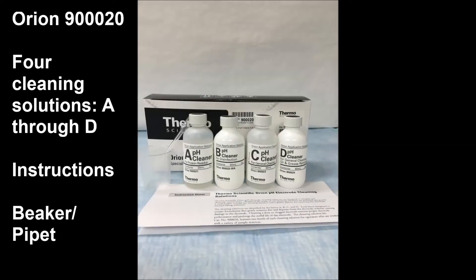Thermo Orion offers a general cleaning kit with four different solutions, A through D. Contained in this kit are each of the four solutions, instructions, as well as a beaker and a pipette to perform your cleaning.